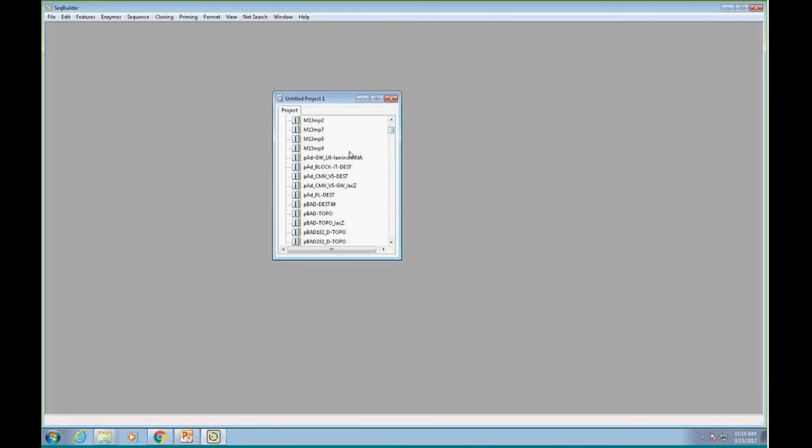Now I could select the whole thing. It takes about a minute to do the annotation. I don't think we want to watch for a minute, so I'm just going to select a collection of them, just some different ones. I'll just take a block here. That's easier. Okay, so we're just going to select a group out of there.